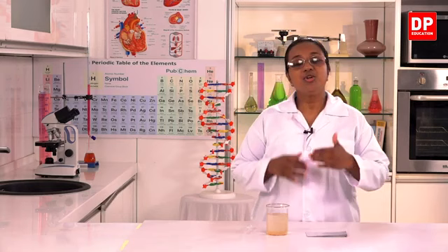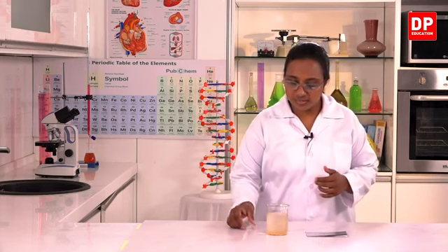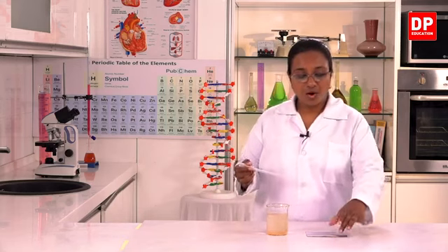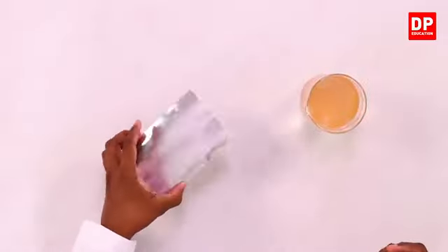So students, to confirm that the components are not distributed evenly, what we can do is take a drop of the mixture from the top as well as the bottom onto this metal foil, or you can use a metal plate.